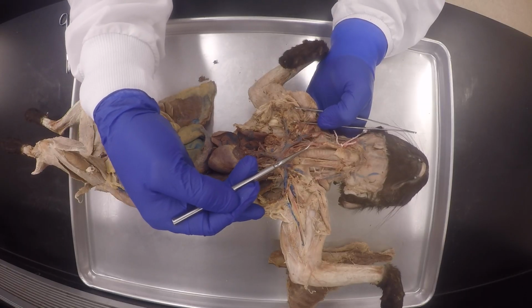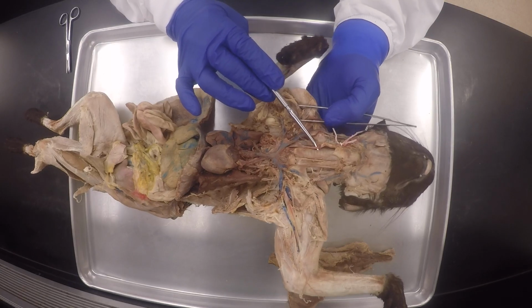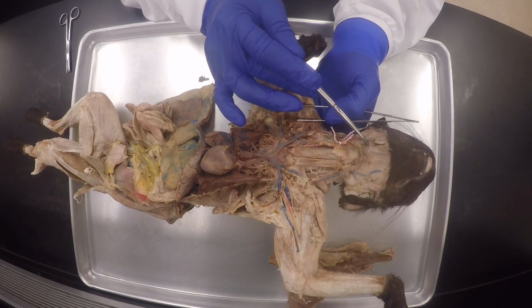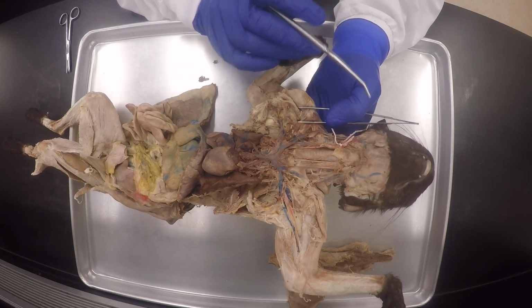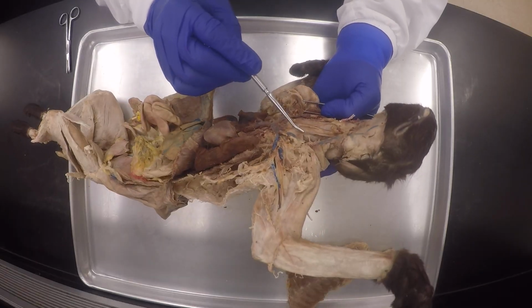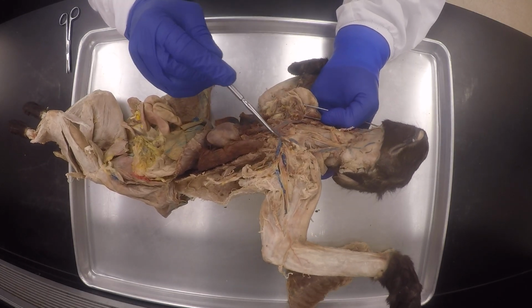So there's the common carotid artery right here, and like I said, you see the larynx, and it's gonna split up here, so we don't see the internal and the external carotid arteries. But there's the common carotid at least, and there's the common carotid on the other side.